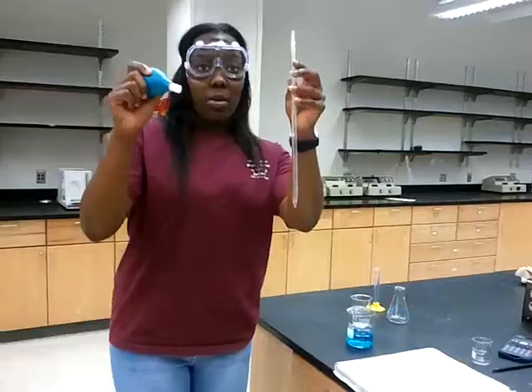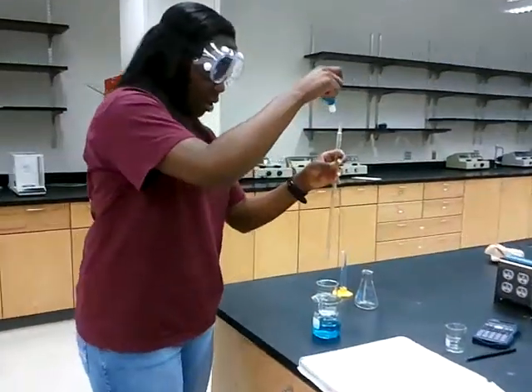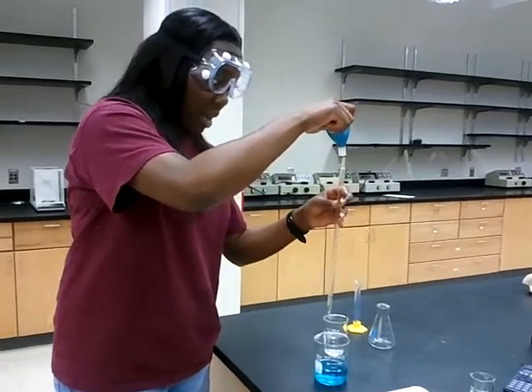Okay, now we'll proceed to measure our liquid with our pipette. And in doing so, we're going to get our final volume and our initial.